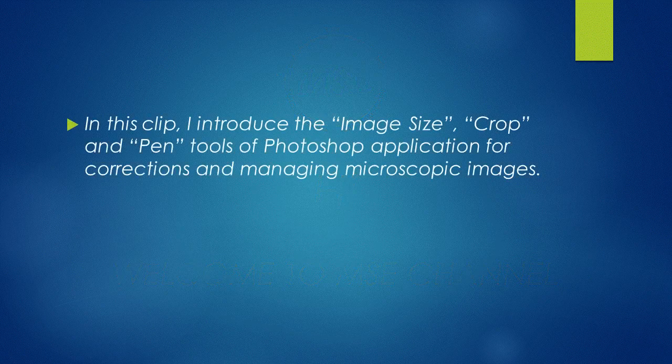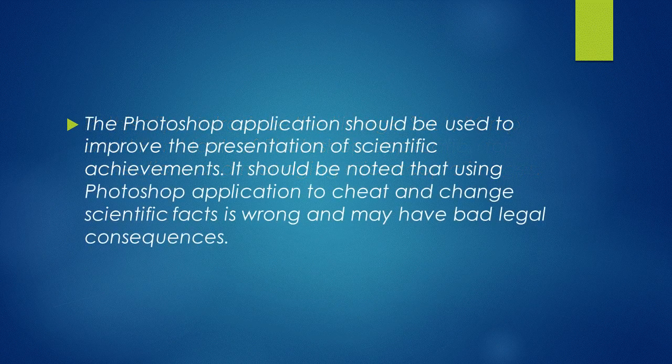In this clip, I introduce the image size, crop, and pen tools of the Photoshop application for corrections and managing microscopic images. The Photoshop application should be used to improve the presentation of scientific achievements. It should be noted that using Photoshop to cheat and change scientific facts is wrong and may have bad legal consequences.